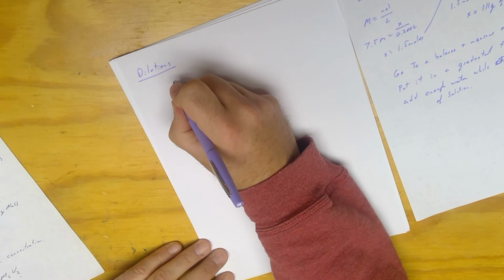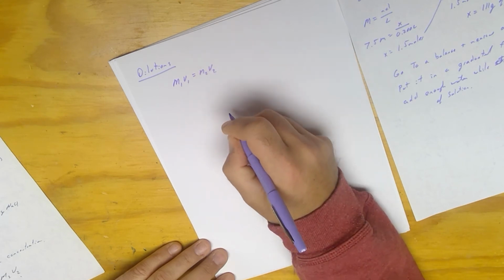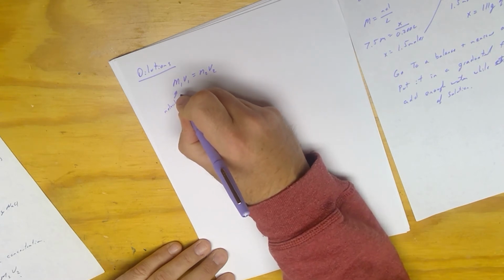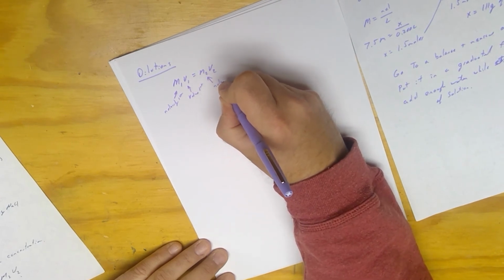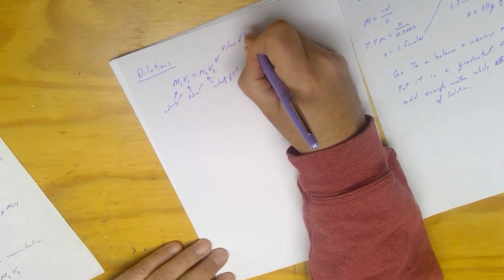And we're going to use a different formula. We're going to use M1V1 equals M2V2. This is molarity of the first. This is volume of the first. This is molarity of the second. And this is volume of the second.